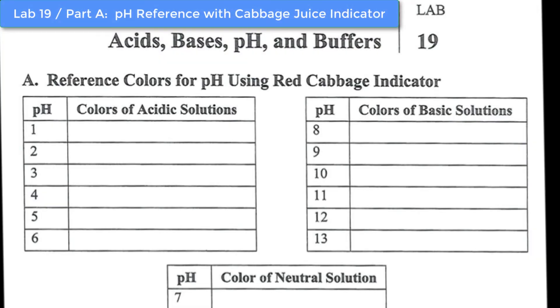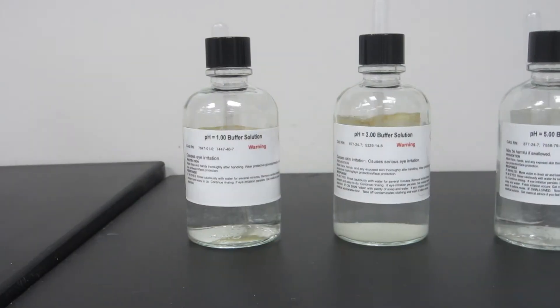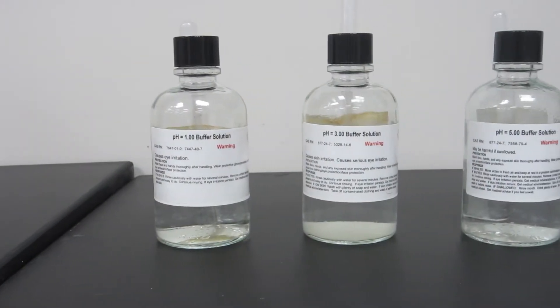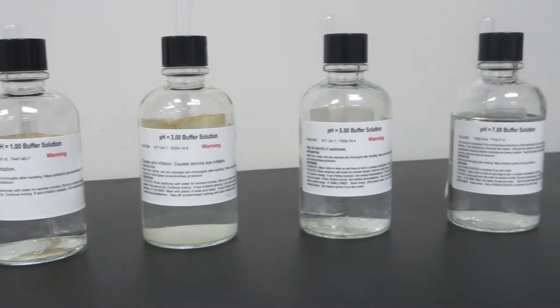In part A of lab 19, we're going to use red cabbage juice as an indicator for pH. Red cabbage juice, when placed in solutions at different pHs, will turn different colors, and that's what you'll see in this lab. What you want to do is record the color of the solution as you watch the video. You can pause the video and then write down your answers.